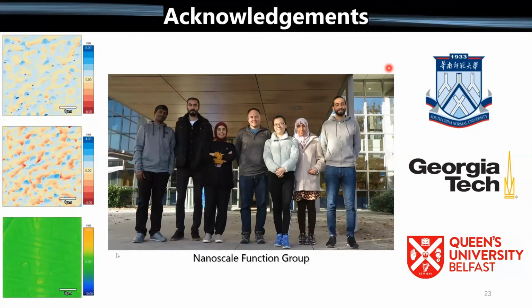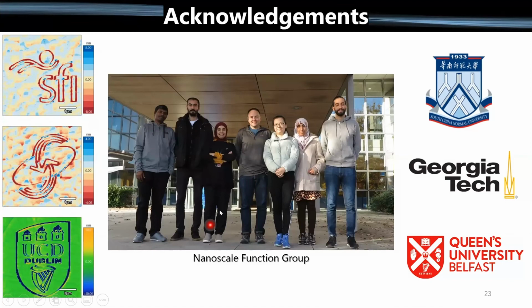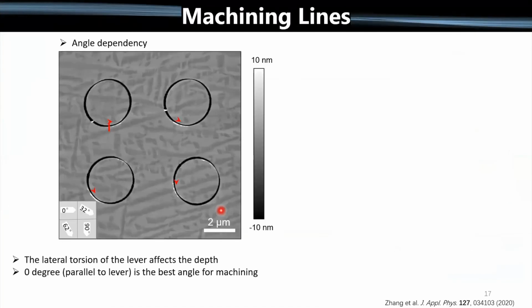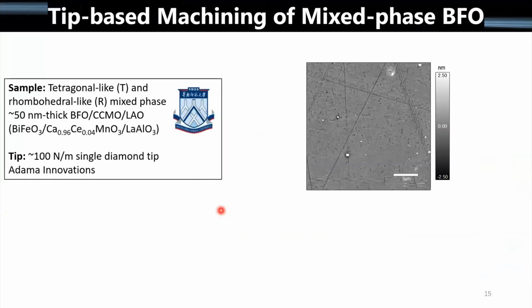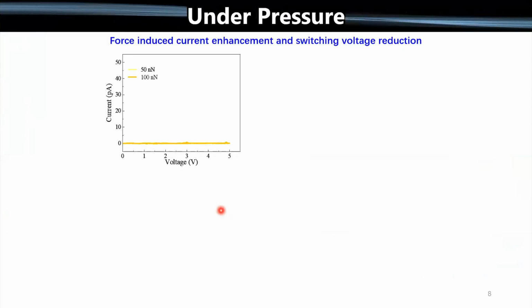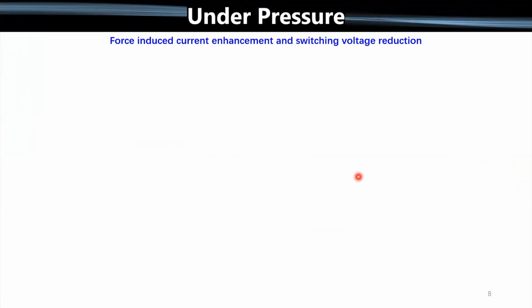I'm not sure, is this for the ferroelectric switching? Satyam, if you are there, yes. Okay. The errors are coming from doing multiple loops on different locations of the sample. It's kind of like an average, and if there is more variability for that particular force, at higher forces, it's possible that the tip slips a little bit, so that could lead to some variability as well.